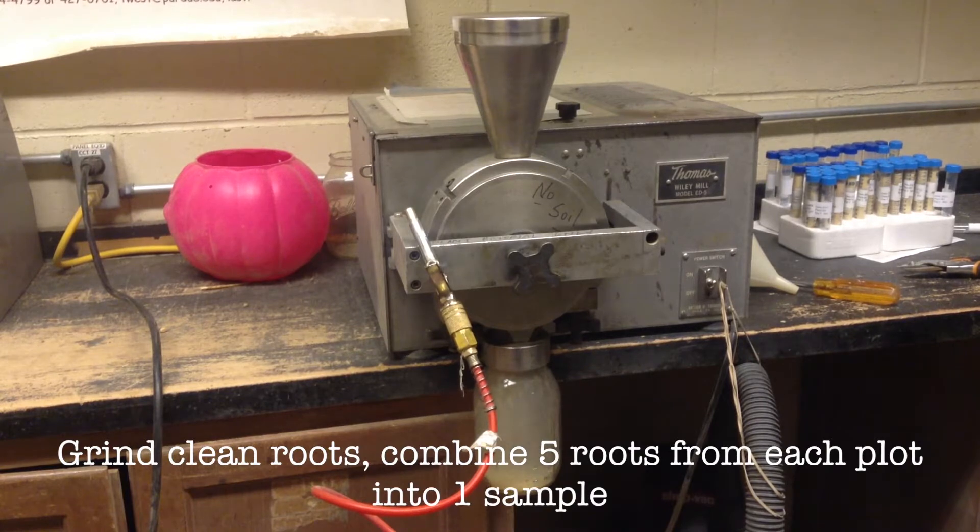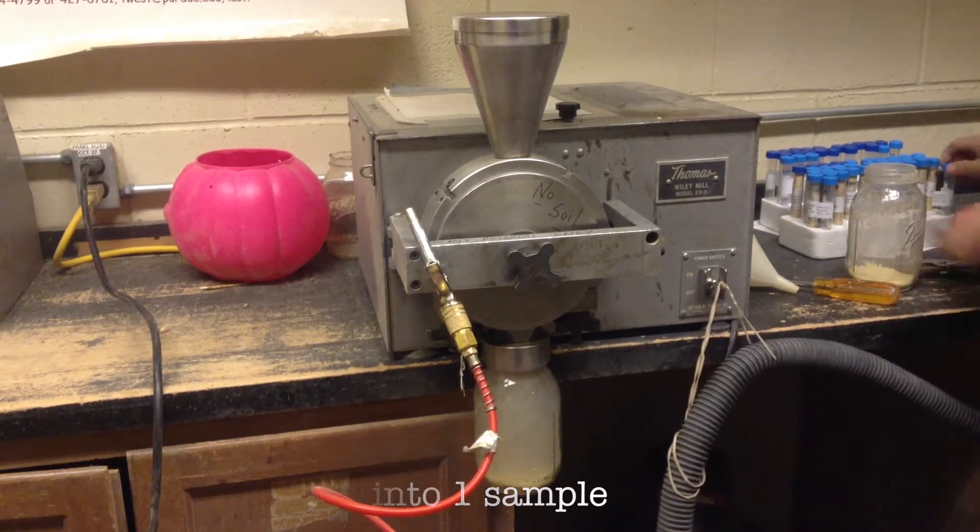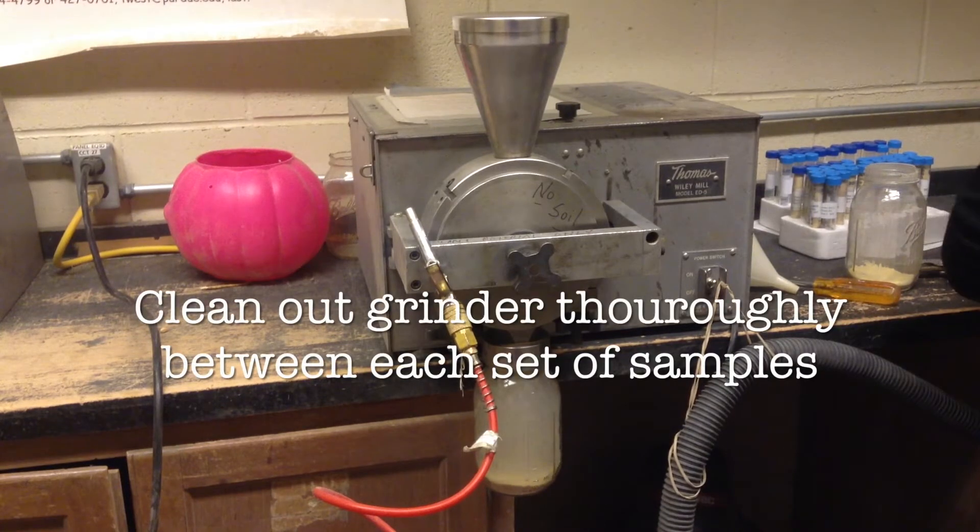We will combine the samples that we took in the field to get one sample per plot. It is important to clean the grinder out between each treatment.